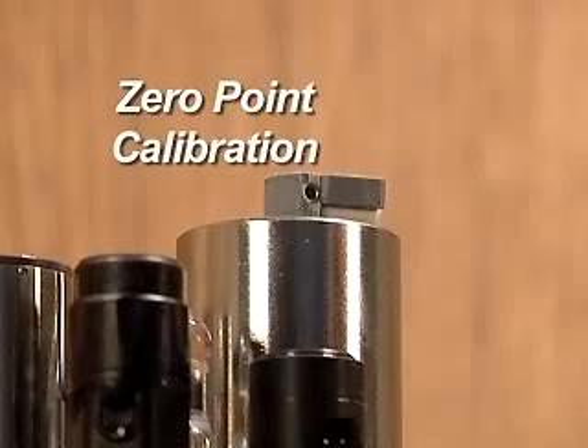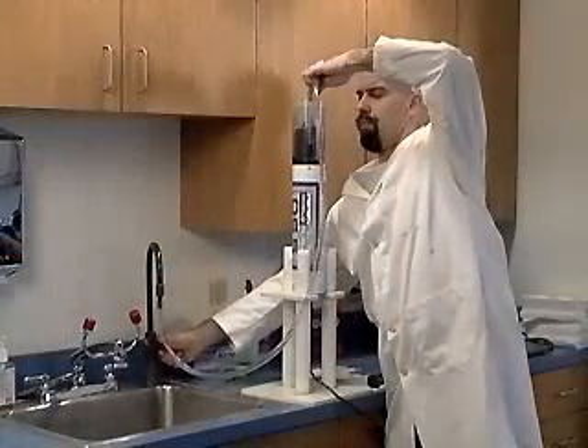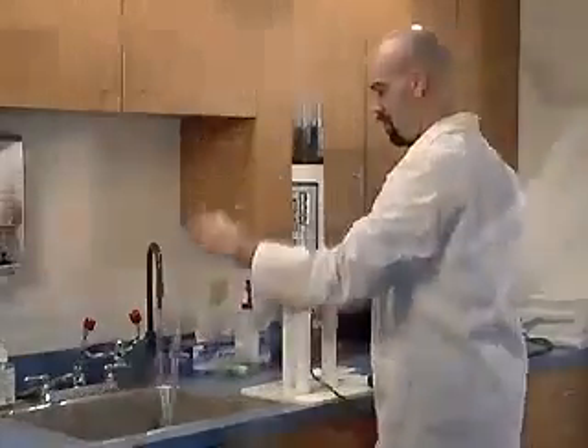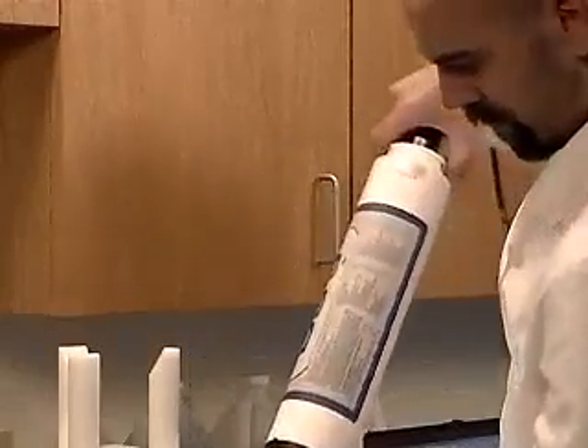Zero-point calibration. With the sensors pointed upwards, fill the storage cup approximately 75% with deionized water, or less than 0.1 NTU stable cal, and screw the storage cap on tightly. Slowly turn the sonde over so the sensors point downwards.